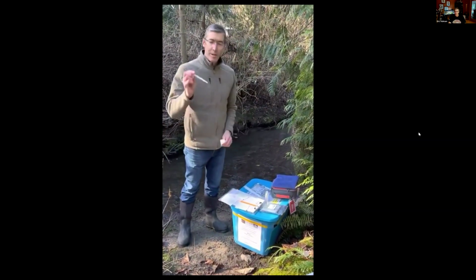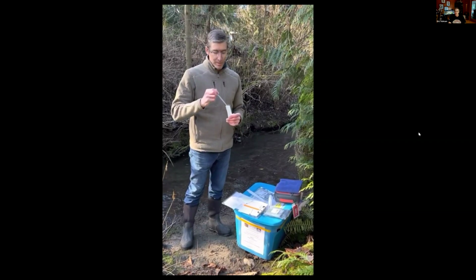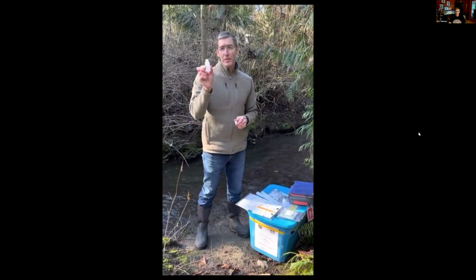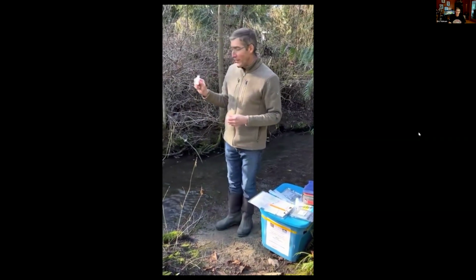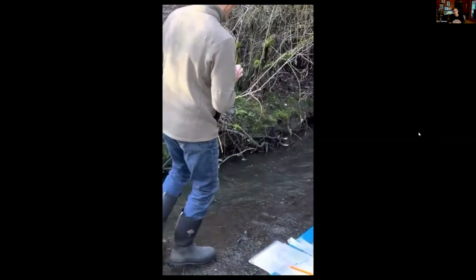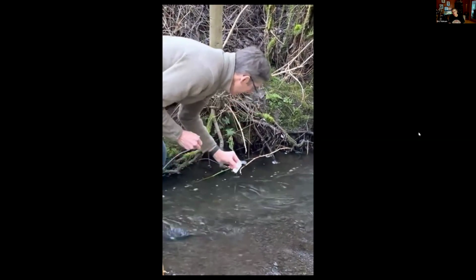So I could do up to 3 samples with the same pipette. For our purposes, I'm going to demonstrate collecting a sample with the 1 milliliter pipette. So I'm going to put this one away, and I'm going to use a different sample. The next thing I'm going to demonstrate is collecting the sample with the container, the sterile container that comes with the R card. So in this case, and in every case, remember, if I'm standing in the stream, I want to collect the sample upstream of myself, or I may not even have to get into the stream at all. So in this case, I'm getting into the stream, and I'm collecting the sample in my sterile container.